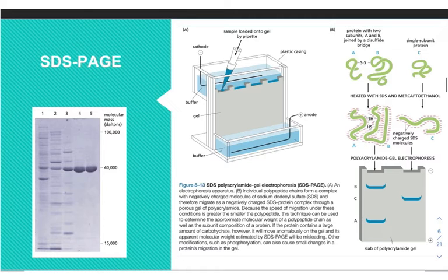And usually in gel electrophoresis, you'll have a ladder, which is like a control group that has molecules of certain masses so that you can see where they're supposed to end up on the gel.